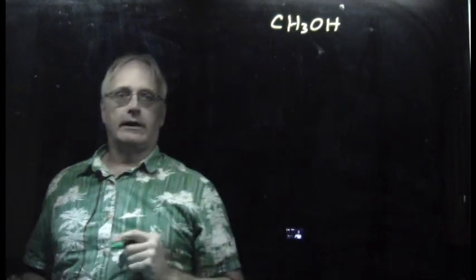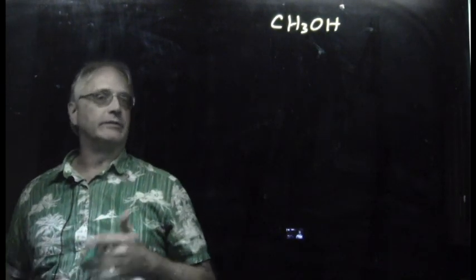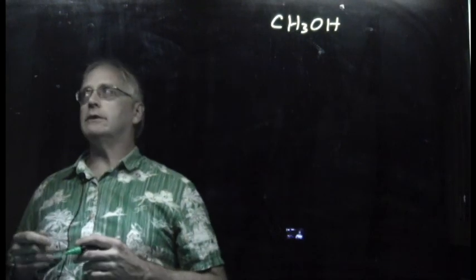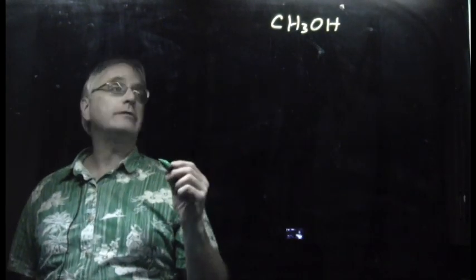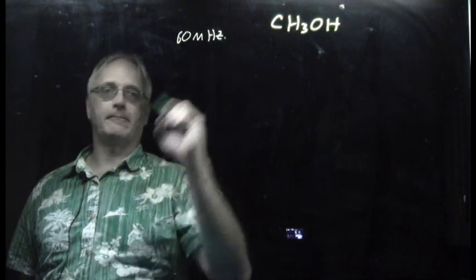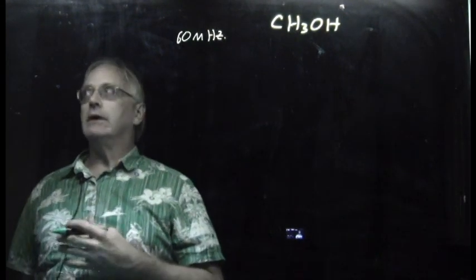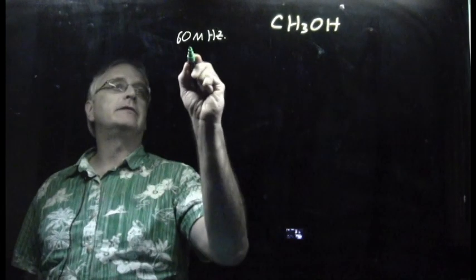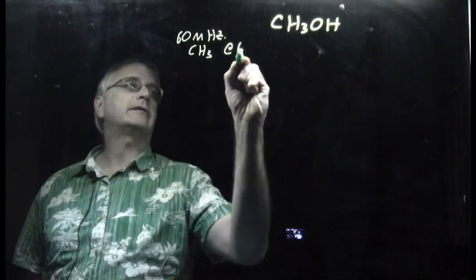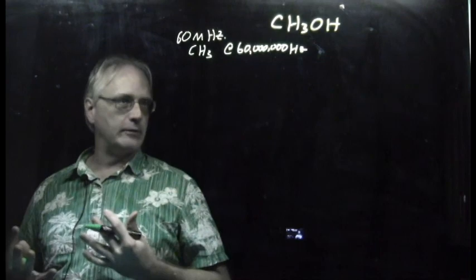This was the compound I was kind of fancifully talking about as something measured in various NMR instruments, some with weaker magnetic fields, some with stronger magnetic fields. Now, what I want to convey is on an old instrument, and we used to have one of these that operated at 60 megahertz. Okay? We would have said, before the standard TMS was used, that the CH3, the methyl group of methanol, was measured at 60 million hertz, 60 megahertz. That was its frequency.